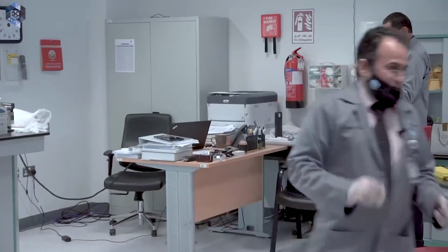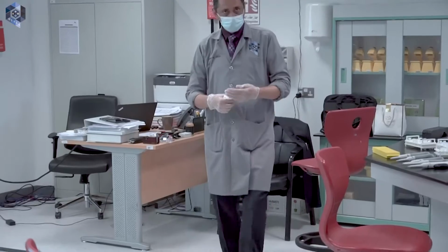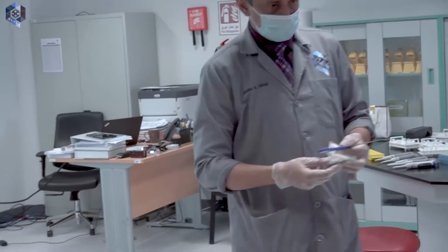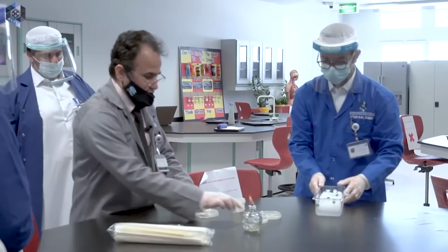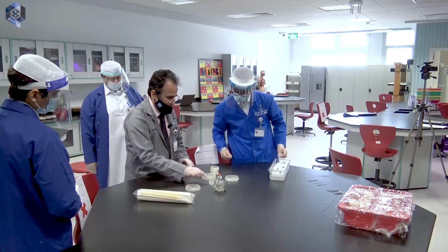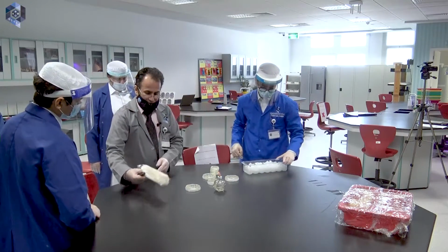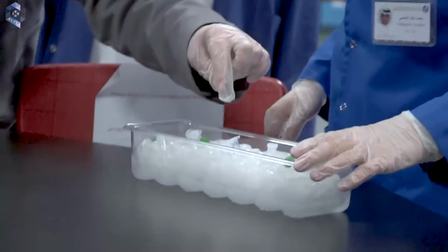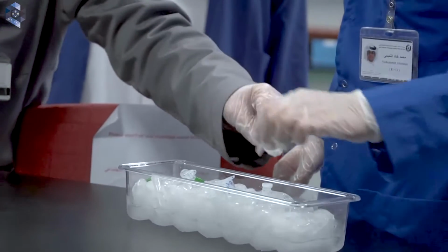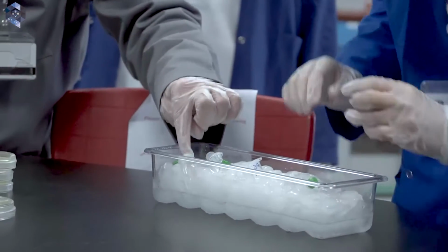Now, do you want me to demonstrate this process for you, or can you do it? What do you think, Muhammad Khalid Tamimi? You will choose 5 well separated colonies. Good. And transfer them using the inoculating loop to the tubes we have just prepared, the ones with the green caps, and there are 2 others. This one. It's here. Okay.